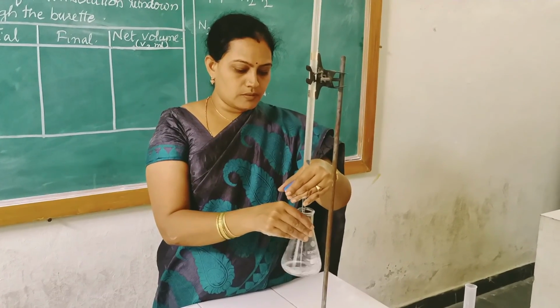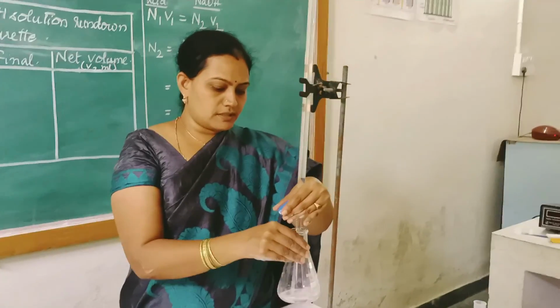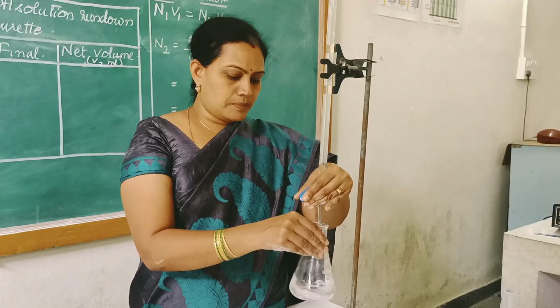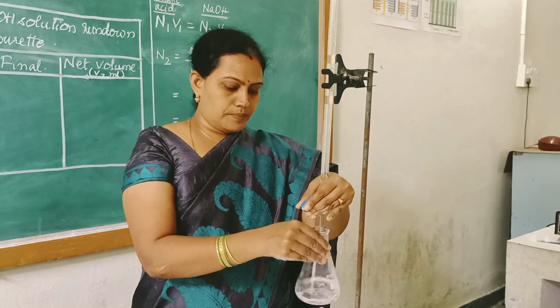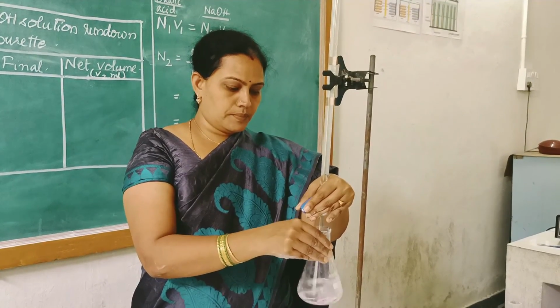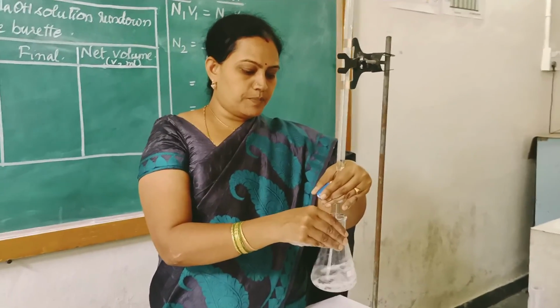You can run down the solution slightly faster initially. Once you find the change in the color, slow down the burette. And the color has to be pale pink.